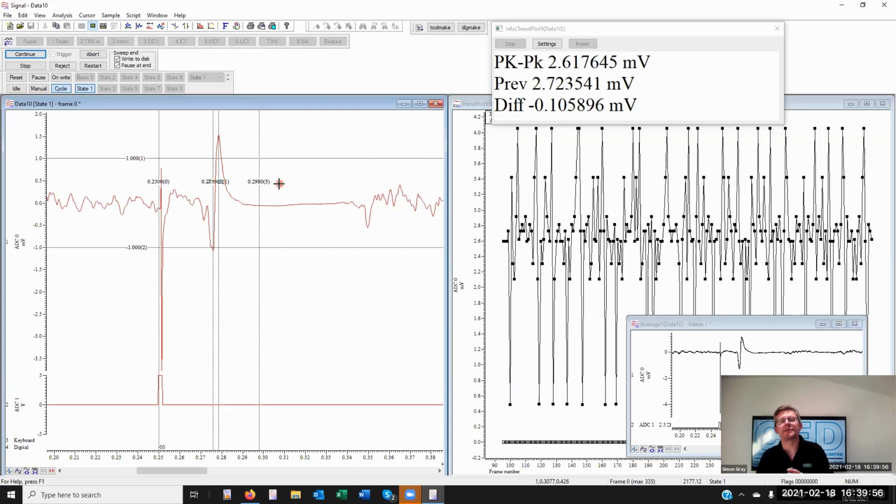For such features as minimum and maximum, we're always going to find something. There'll always be a minimum and maximum. It'll find the first in the list of maximums or minimums if they are the same amplitude. If we're looking for peaks or troughs, we will find the first that matches the parameters that we've specified in the given direction that we're looking. So we could be looking backwards through the frame, or forward.